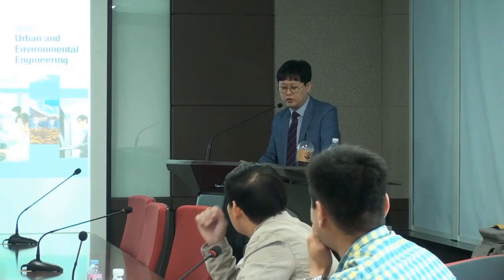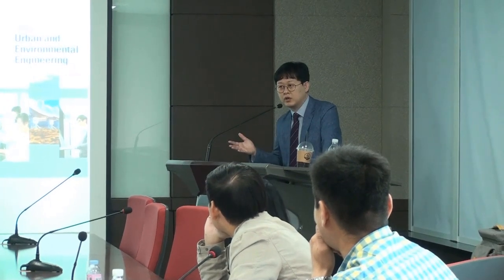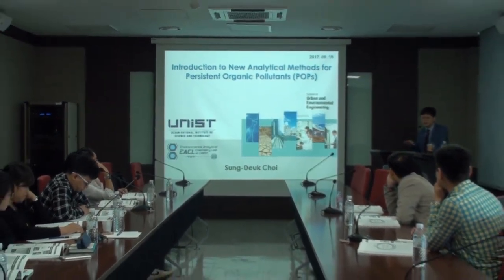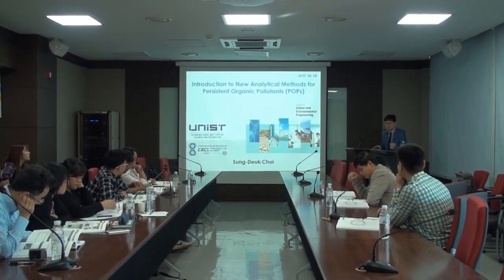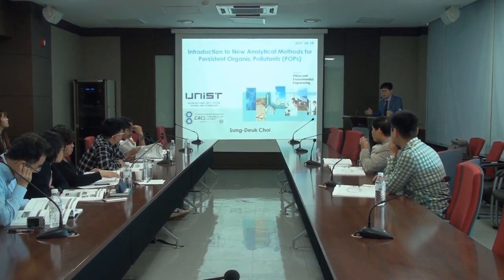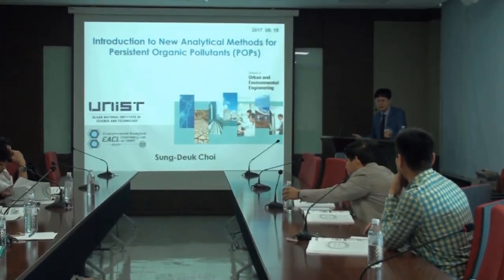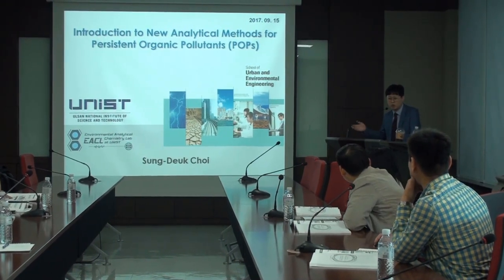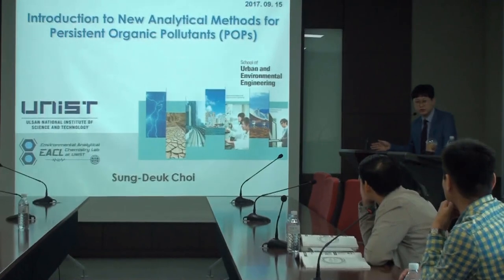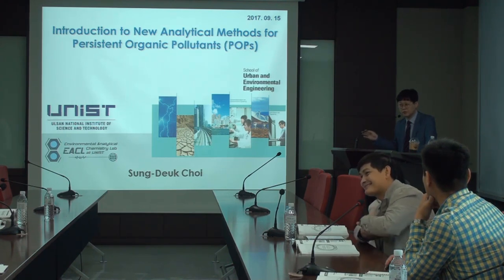So today, the main topic is the introduction of a new analytical method. But before we talk about this new instrument and technologies, we have to clearly understand the basics of POPs, the analytical schemes, and some basic topics of mass spectrometry. Step by step, I will explain. If you cannot completely understand, it's fine. This level of course is actually aimed at PhD students. If you have a strong background in chemistry and instrument analysis, it's very easy to understand. But if you have no strong background, it's a little bit harder to clearly understand the concept. But no problem.